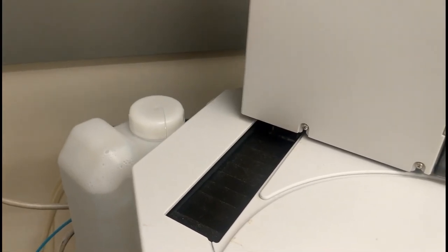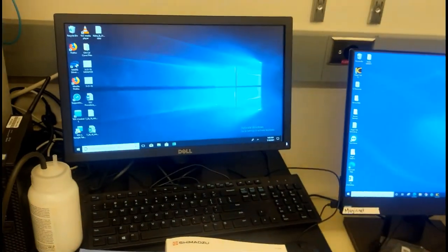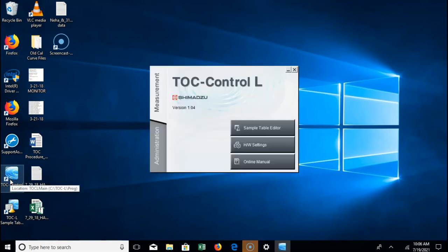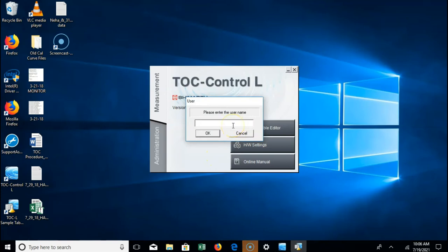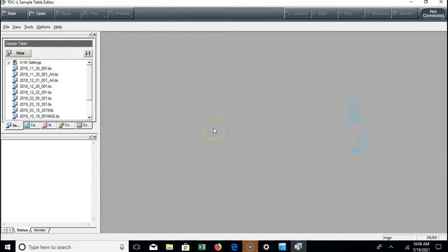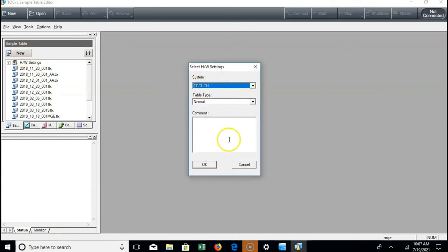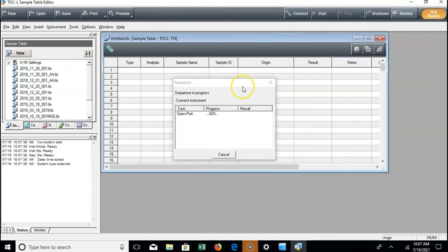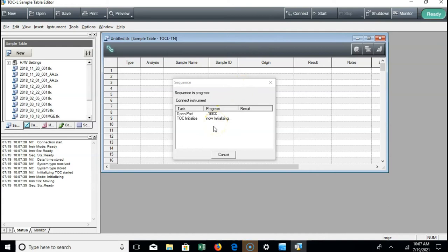Now if all the bottles are filled with the correct reagents, we're ready to go over to the computer, open up the software, and start setting up our run. We'll open up the software by clicking on the TOC control L icon, then click on open sample table editor. Type your initials and hit okay to open the software. From the home screen, open a new sample table, select the TOC system, and enter any useful comments. Once you have a sample table open, you can connect to the instrument — it'll take a minute to connect and the TOC will make some noises as it initializes.